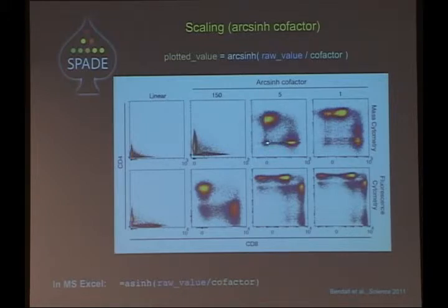The reason here is that CyTOF data tends to be close to 0. 0 is the minimum measurement on our instrument, and because the sensitivity is not so great and because there's very little background, we are often dealing with data that's important data, and it's between counts of like 5 and 50. And so those low values here are important to us, and we want to capture them.